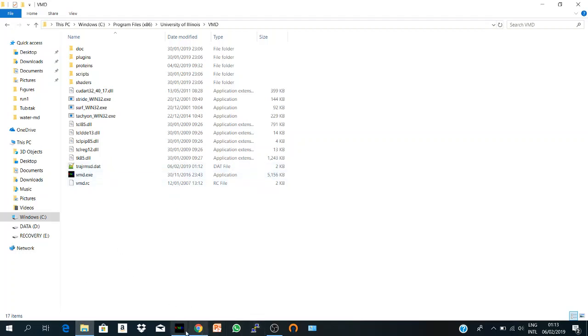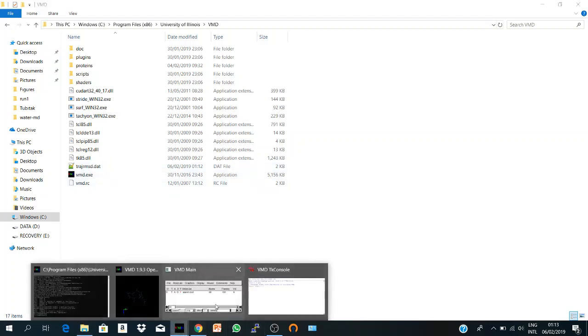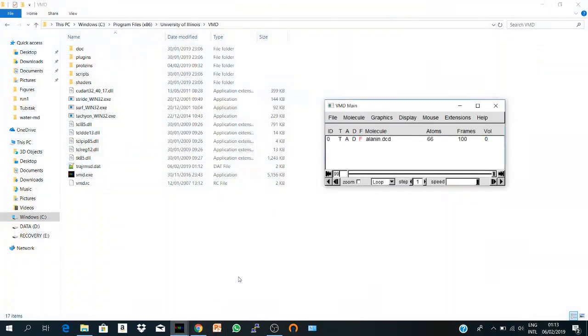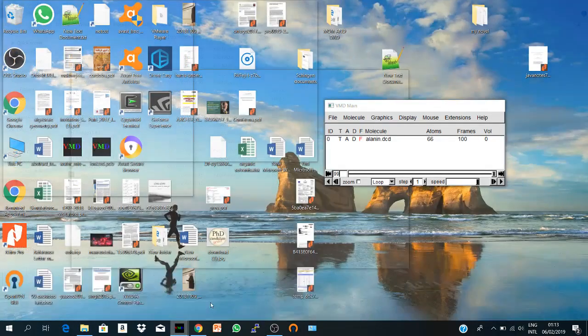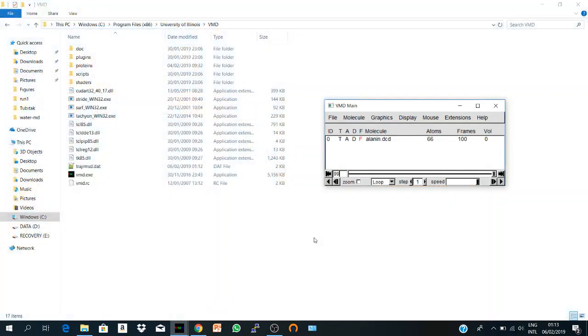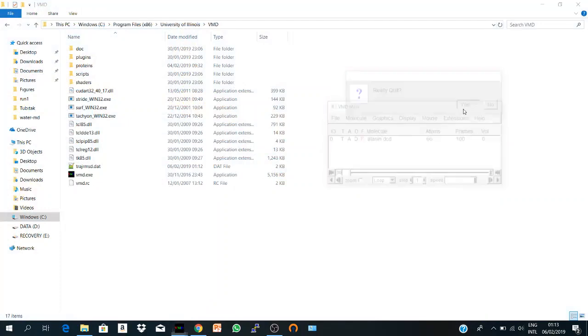So now you calculated the RMSD using VMD and that's it. Thank you all. Thank you.